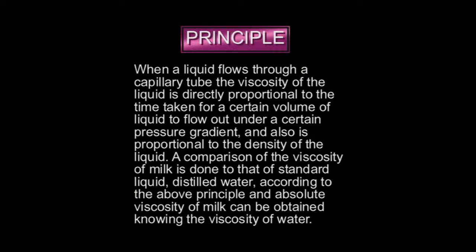Principle: when a liquid flows through a capillary tube, the viscosity of the liquid is directly proportional to the time taken for a certain volume of liquid to flow out under a certain pressure gradient, and also is proportional to the density of the liquid. A comparison of the viscosity of milk is done to that of a standard liquid, distilled water, according to the above principle, and the absolute viscosity of milk can be obtained knowing the viscosity of water.